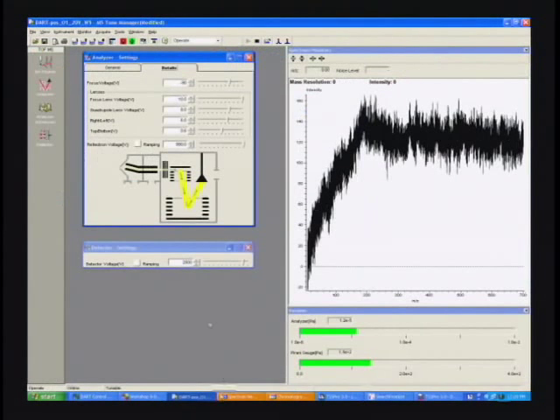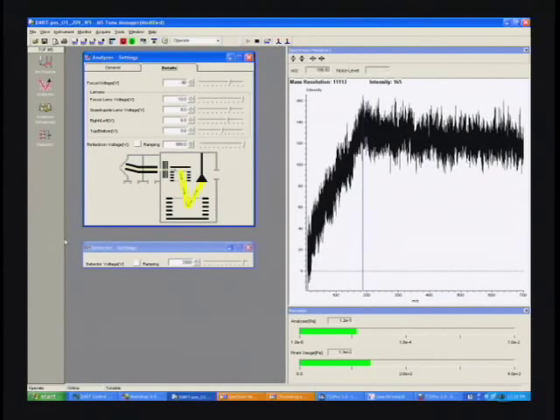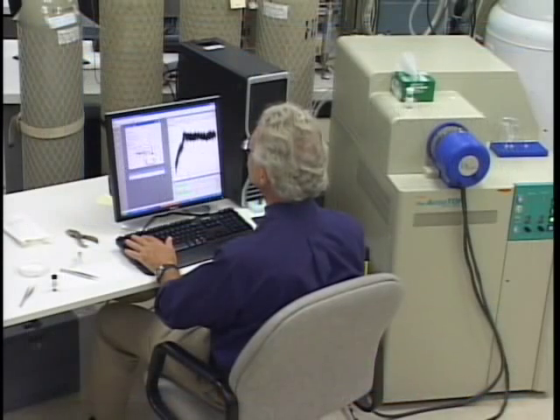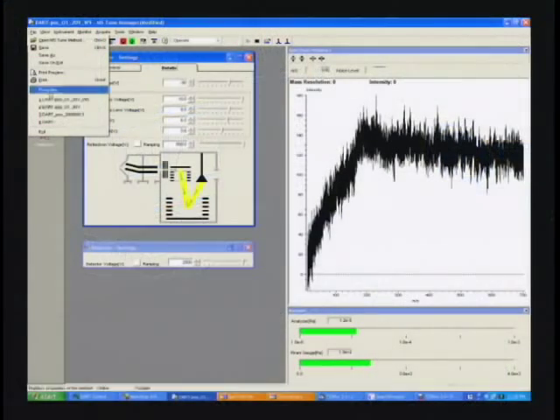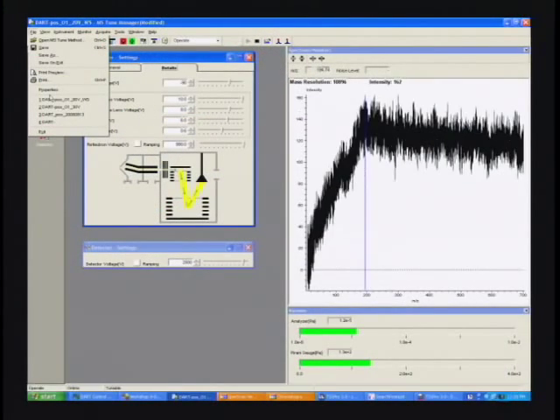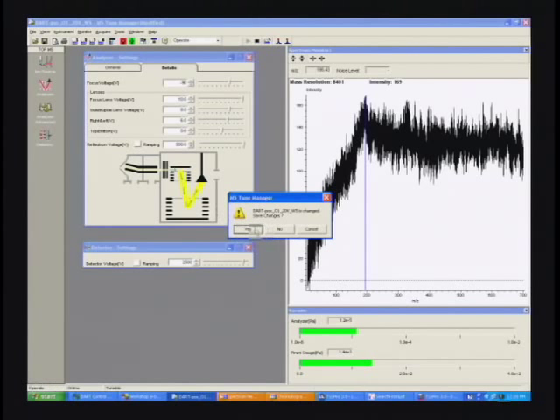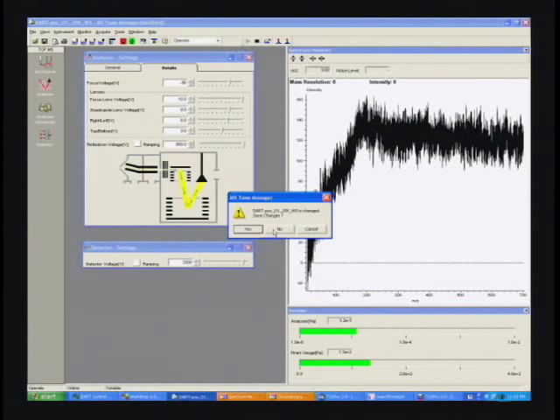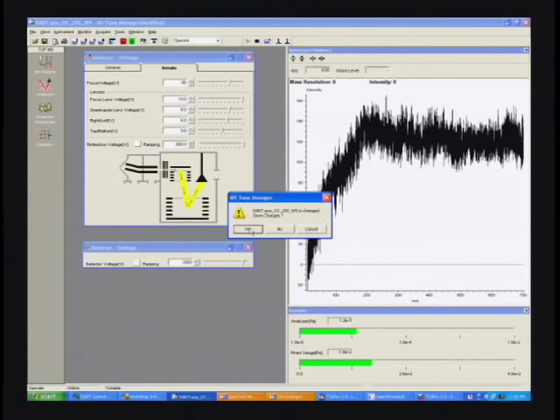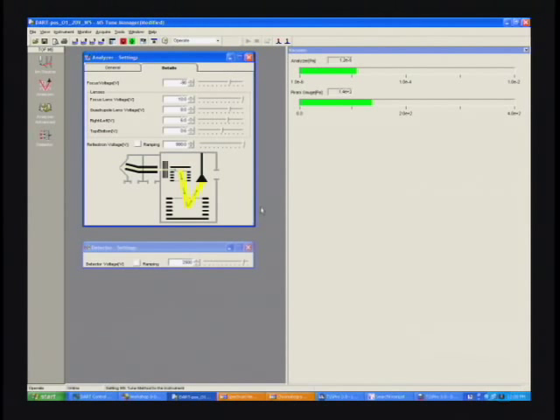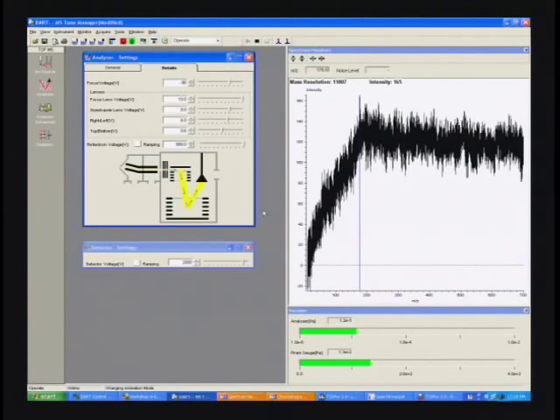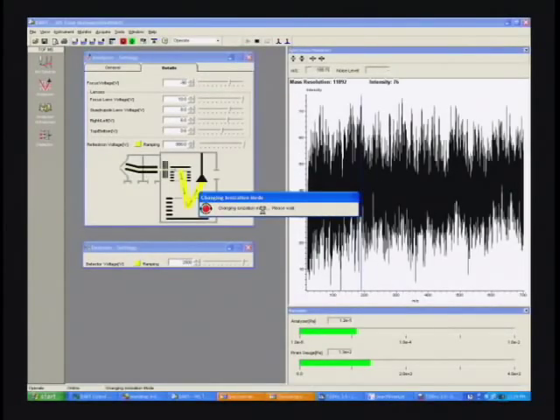We'll go ahead and look at some explosives in a standard mix. To do this I'm going to switch to negative ion mode and what we're doing is loading a fairly old instrument tune file from about a year ago. Tuning is very stable unless we change something in the instrument. So if we load the negative ion file, the instrument's going to switch the multiplier voltage from plus 2500 to minus 2500 or thereabouts. It's going to ramp the electron multiplier voltage down slowly and then bring it back up again at the opposite polarity so that the instrument is protected. You don't have any sudden shocks going from plus 2000 volts to minus 2000.